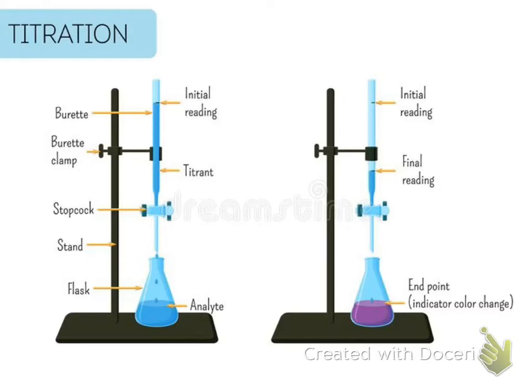Typically in the burette, you're going to put in the solution that you have a known concentration of. So we'll make our lives simple. We're going to say that we're filling the burette with a base. You would read the bottle, and let's say it was 0.5 molar NaOH.